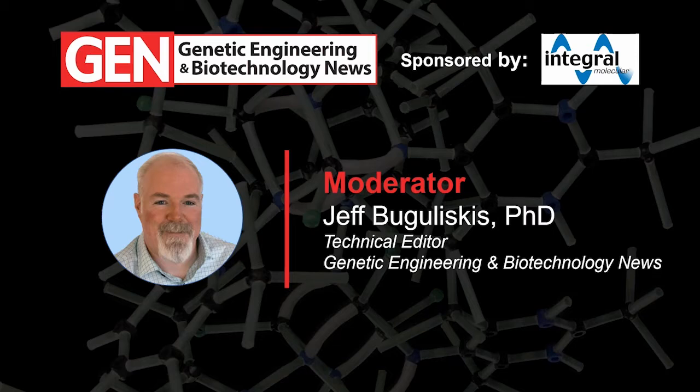Well, thankfully, tools do exist, such as ready-to-use reporter virus particles, or RVPs, that have enabled virus research in BSL-2 environments, allowing for the testing of sera and antibodies in high throughput, along with safe neutralization assays to accelerate virology research. Now, this will all be the center point of our presentation today and what our speakers are going to tell us much more about in just a few moments.